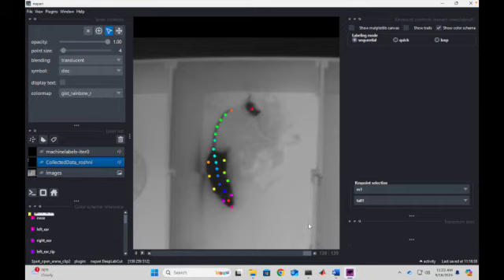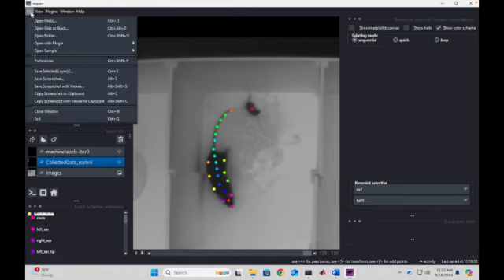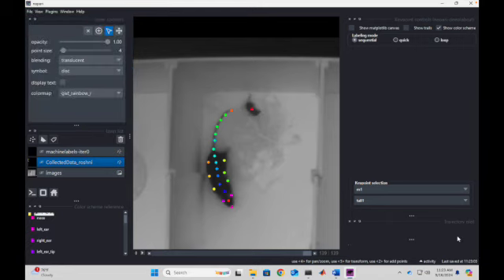Okay, so once you're ready to retrain the model and you finish labeling everything, this has already gone through being saved and then opening it again in Napari, so you can see that it has this machine labels layer and then this collected data Roshni layer. The most recent labels were all adjusted on this collected data Roshni layer, and then you would click File, Save Selected Layers, and down at the bottom you can see this last save time at 11:23:03.